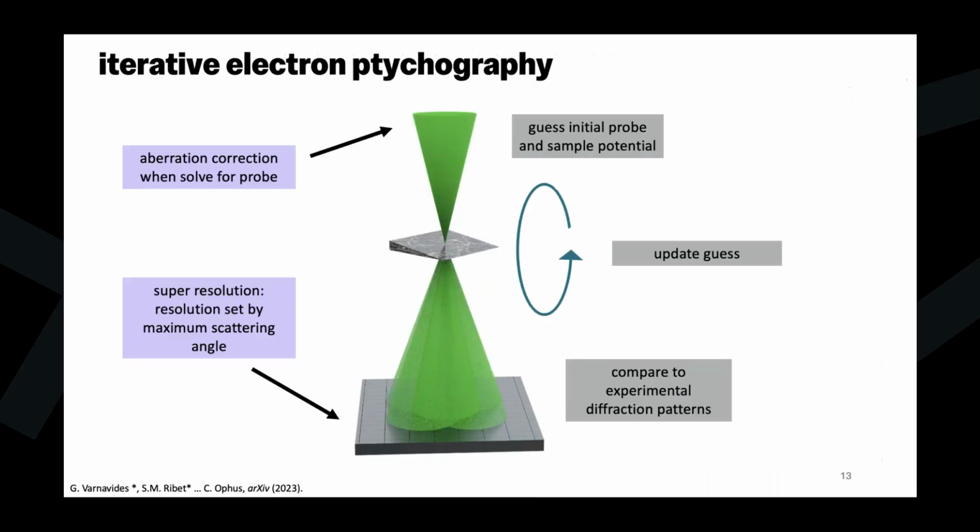We are actually also working on some new code. So this is py4DSTEM, but look out for Quantem. This is an ML-based approach with a lot of ptychography tools.